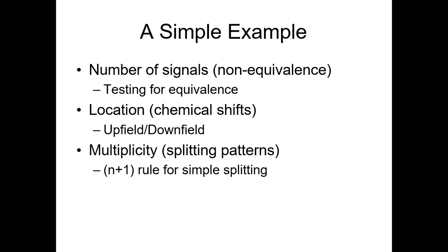So that's how you can use NMR to determine the structure. If you do the NMR and the infrared and use those things together, plus do what's called determining the degrees of unsaturation, those three things, you can figure out a structure from any NMR. If it's something huge and super complicated, it may take more time, but regular, small molecules that don't have a bunch of different protons are fairly easy to elucidate if you have the NMR and have some other spectral data.